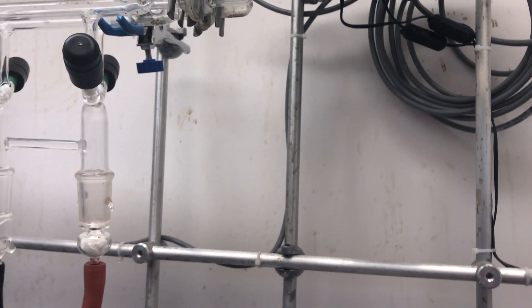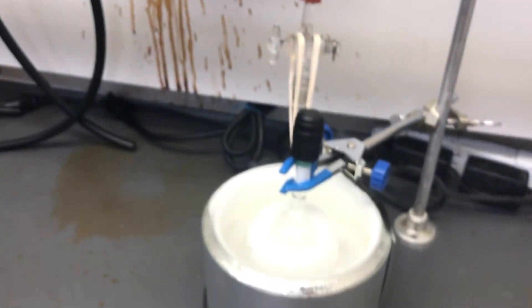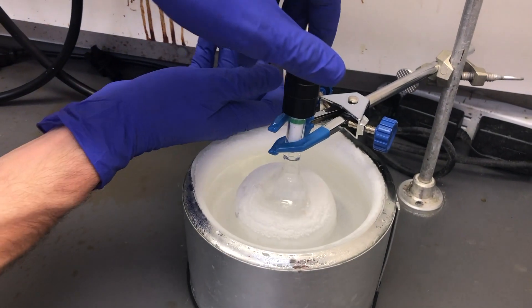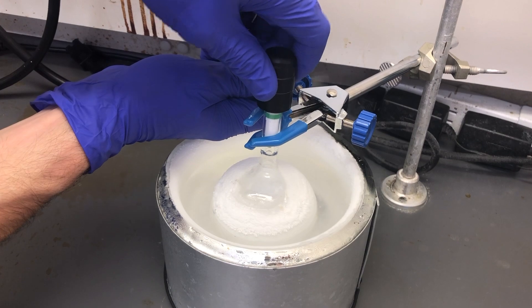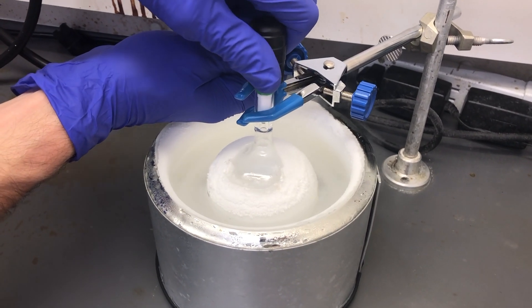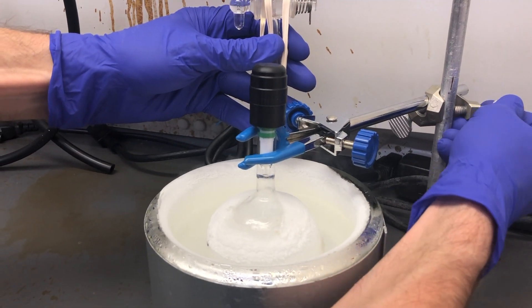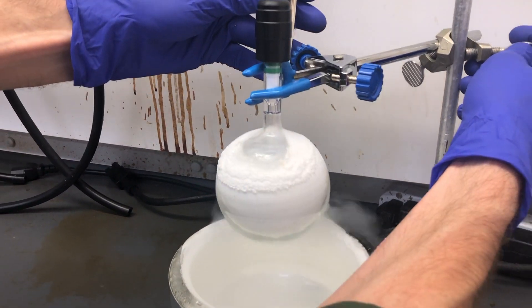Mitch now raises the flask out of the liquid nitrogen, moves the Dewar carefully up and away, and then treats the flask with care — nothing but the best cork ring for it. With the flask closed, the final process is thaw. We are going to allow the flask to warm back up to room temperature. Considering it was around 77 Kelvin, this is going to take a little while.